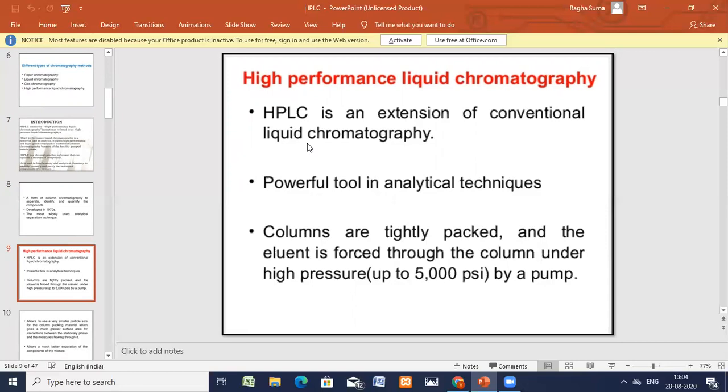and growing interest in the analysis of biological and environmental samples, a rapid, versatile separation technique has become needed for us. And the new technique is nothing but HPLC, high performance liquid chromatography. It was developed as a versatile technique to meet present needs, and it became possible through the knowledge accumulated from the techniques of gas chromatography.